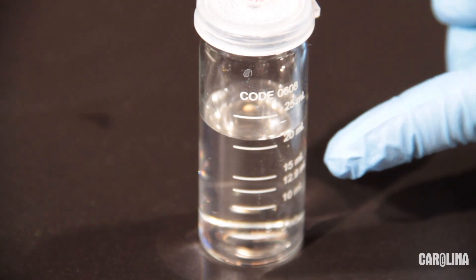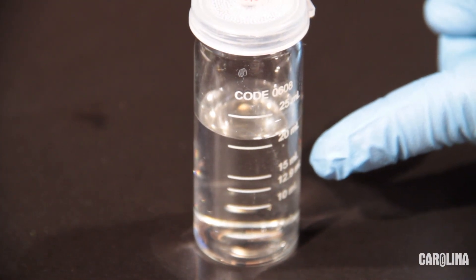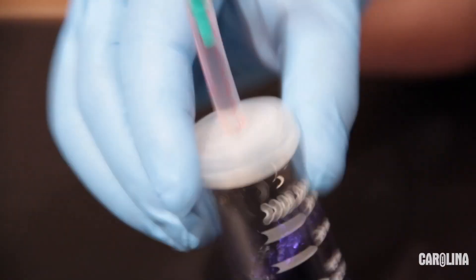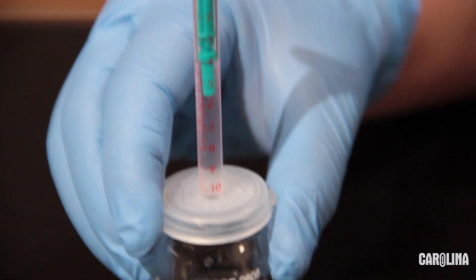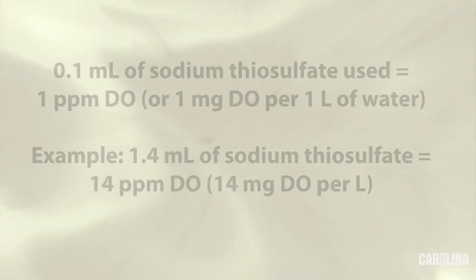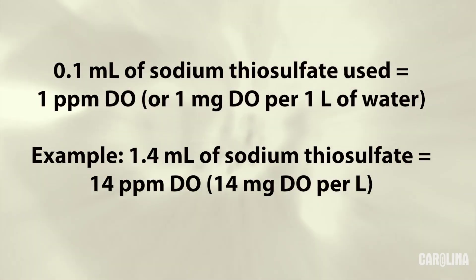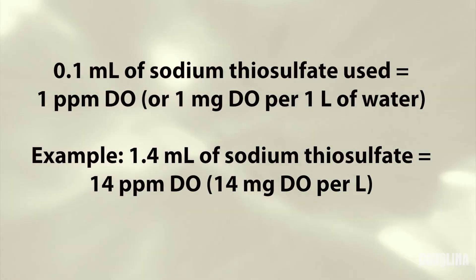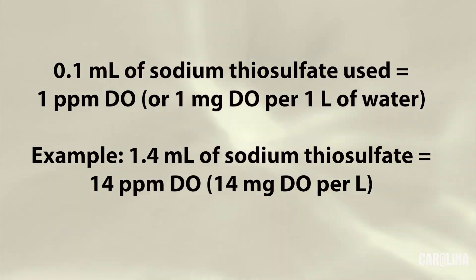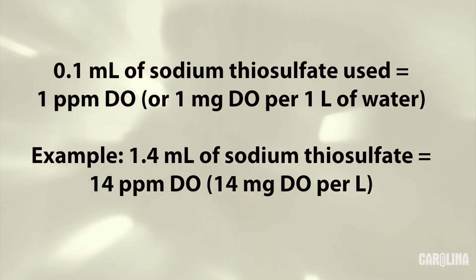Keep track of how much sodium thiosulfate you add. Once the blue color disappears, record the total amount of sodium thiosulfate it took to convert the free iodine to sodium iodide. The amount of free iodine in the sample is proportional to the initial dissolved oxygen level, so the amount of sodium thiosulfate needed to titrate it reveals the original dissolved oxygen concentration. Each tenth of a milliliter of sodium thiosulfate used in the titration indicates one part per million dissolved oxygen, or one milligram of dissolved oxygen per liter of water. For example, I added 1.4 milliliters of sodium thiosulfate; therefore, there were 14 parts per million or milligrams per liter of dissolved oxygen in my sample.